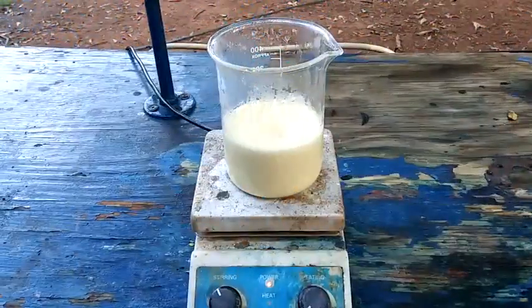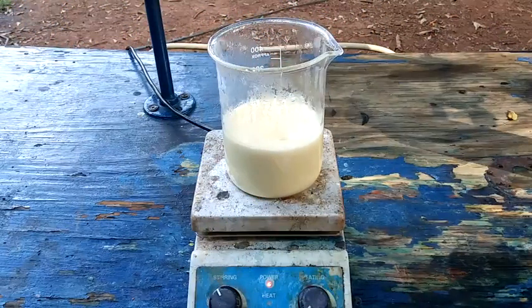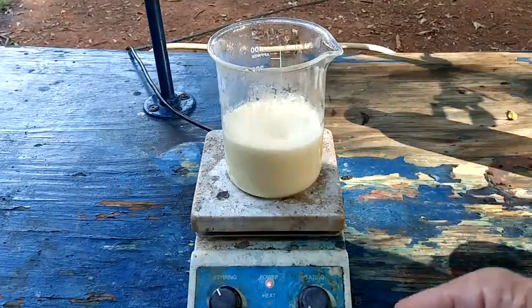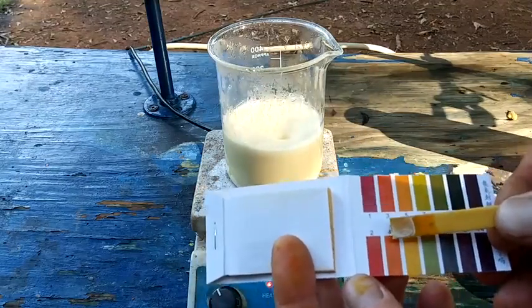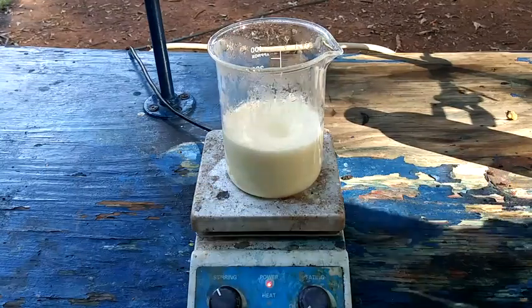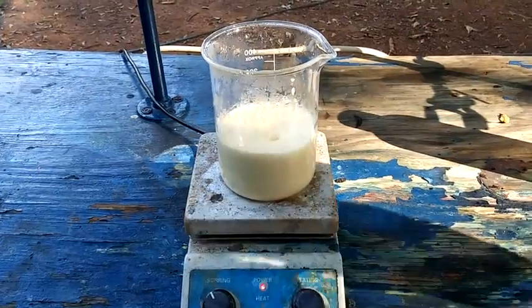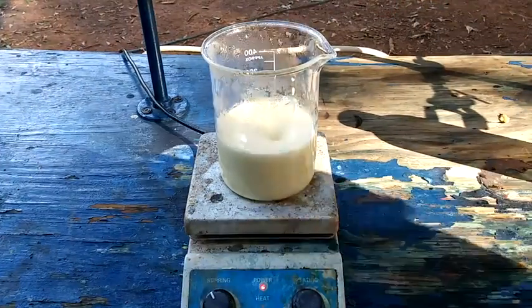Alright, after the last shot, I went ahead and I added a little bit more sodium hydroxide to the mixture here and tested the pH, and this is what I got, which corresponds to, can you see that or not, about a 5. So we're approaching the point where we're going to cross from acid to alkaline here. Won't take much now. It is still very hot though.